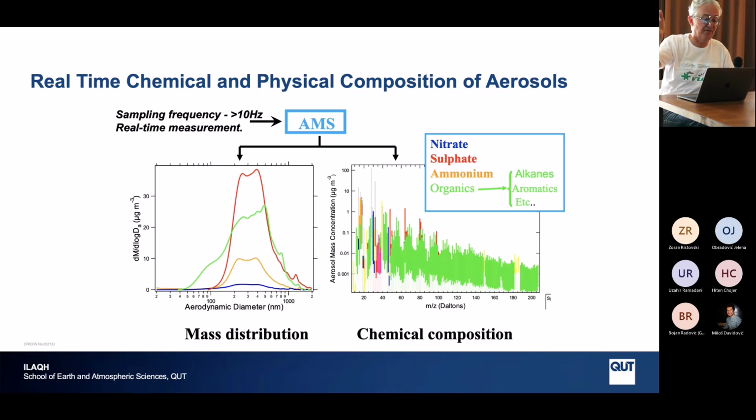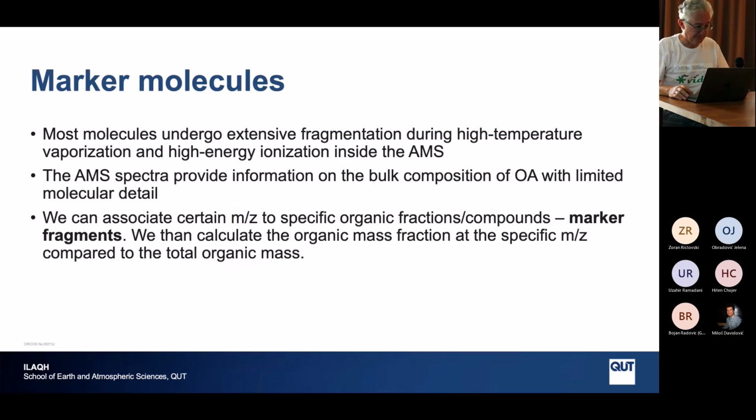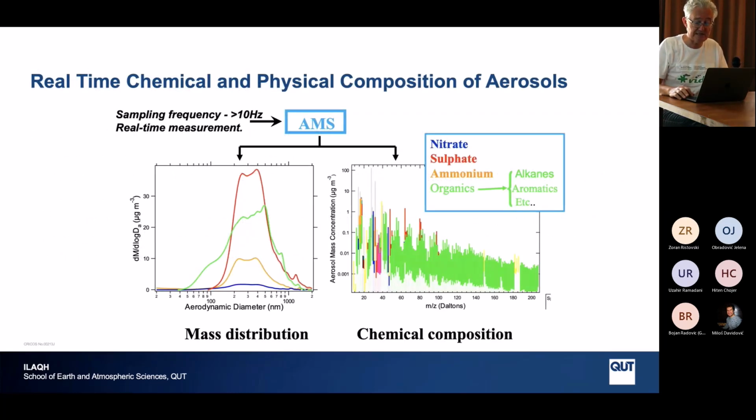The advantage of that m/z mode is that you have much faster sensitivity because you continuously measure. With the chopper, you measure once at 100 hertz. You only let a small amount of particles through, most of them are blocked. So if you have a small concentration, you switch to this mode. So that's the way it works.